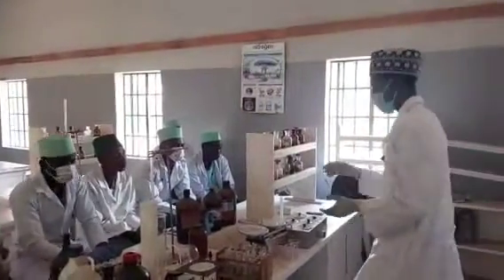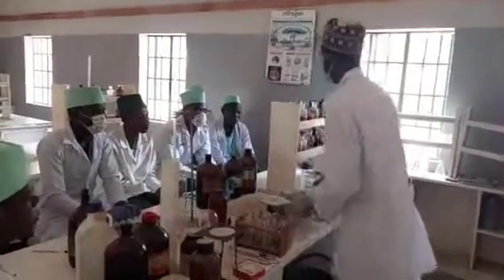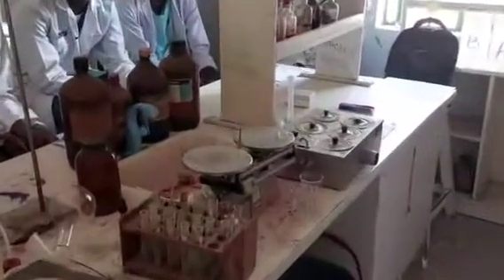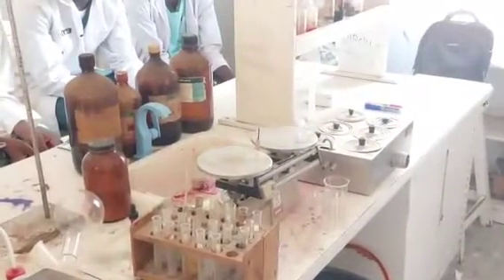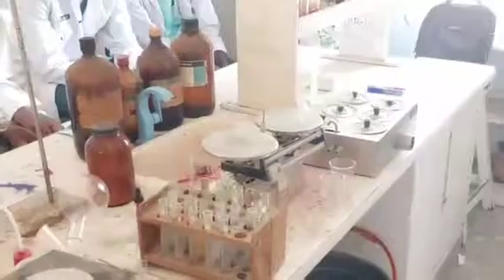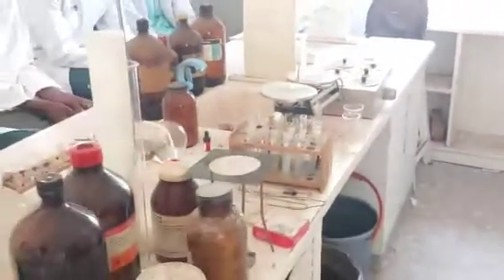So upon what we have said earlier, I think with this we can call it a day. Sorry, I have not introduced this. This is a beam balance. What do you use a beam balance for? For measuring solid samples. Under quantitative analysis, we said we have the volumetric and the gravimetric. The gravimetric is the direct measurement of mass.